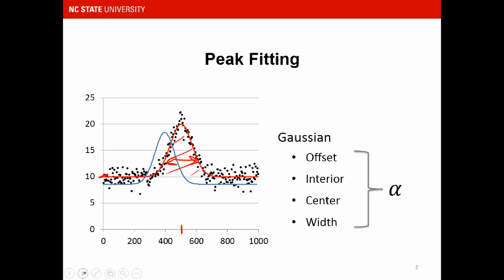The goal of peak fitting is to develop an understanding of the alpha values for our particular data set, whether that is providing a single estimate of each or the most plausible range of values for each. In a materials characterization setting, we are interested in knowing alpha, as that is what allows us to understand the properties of our material of interest.